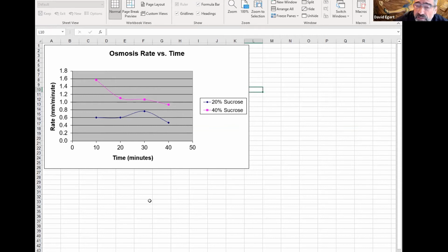If we did this in a much more rigorous way and with more data, and we started seeing interesting, weird things, then we might think, oh, what might that really mean? But given that there's only a few groups and it's a notoriously tricky lab to get right, I would not put too much energy into interpreting what's probably noise.